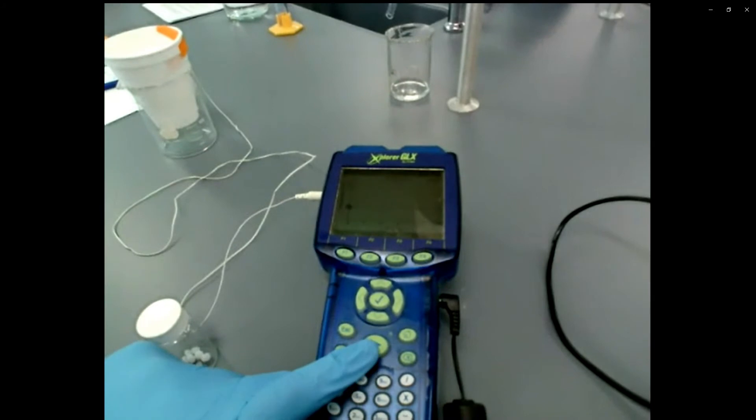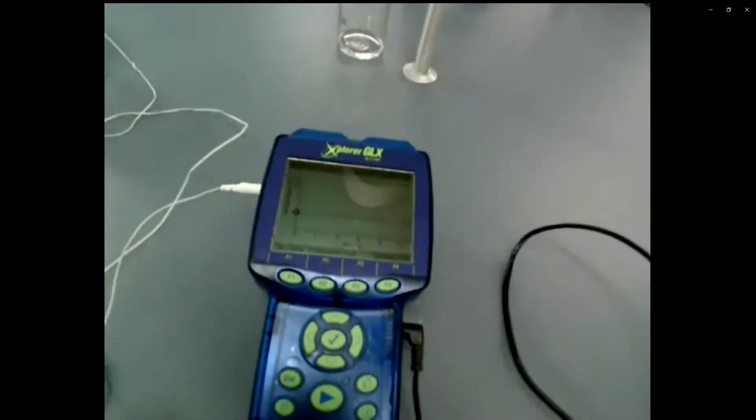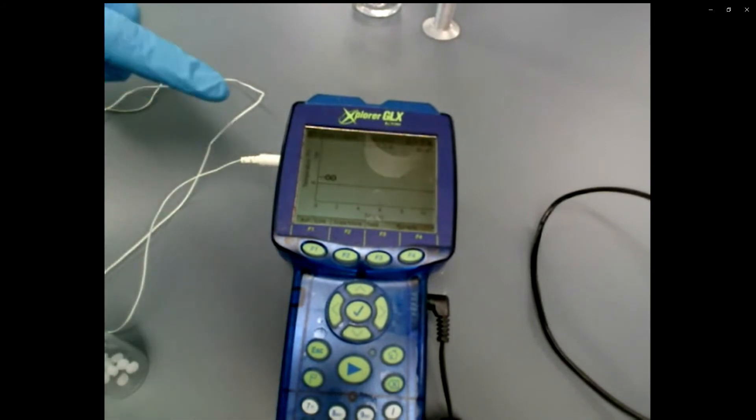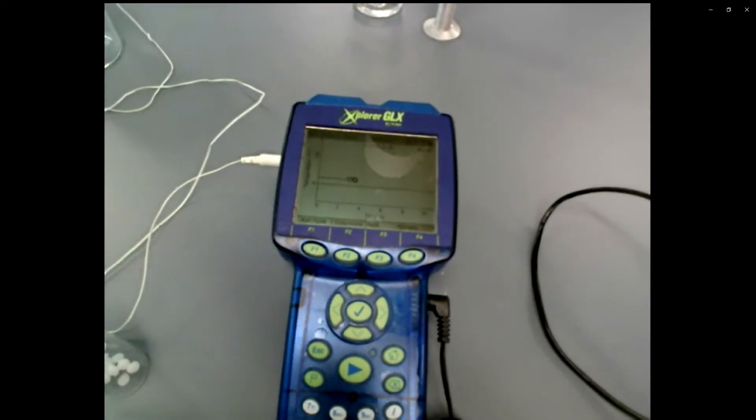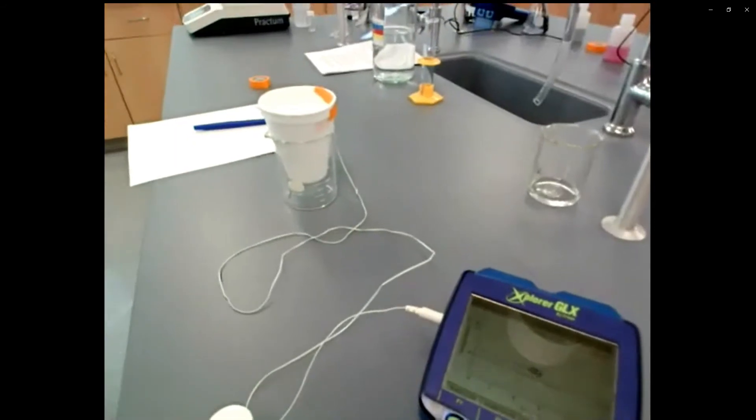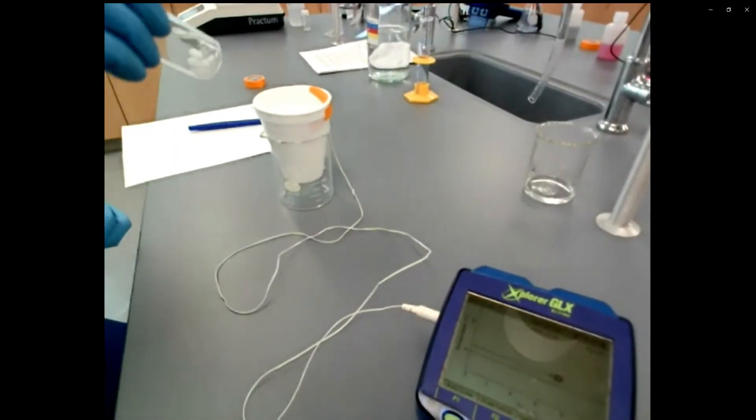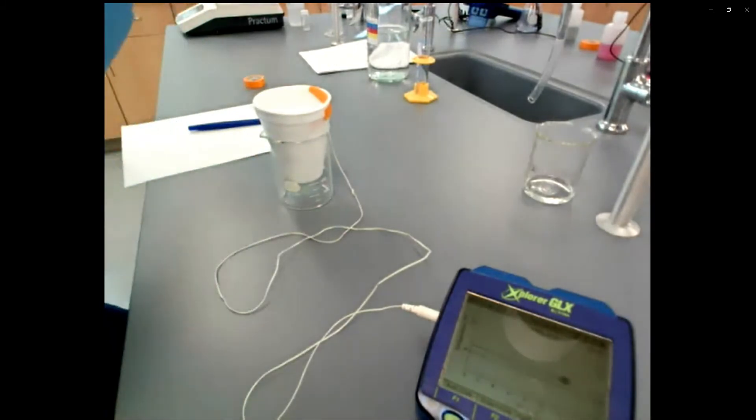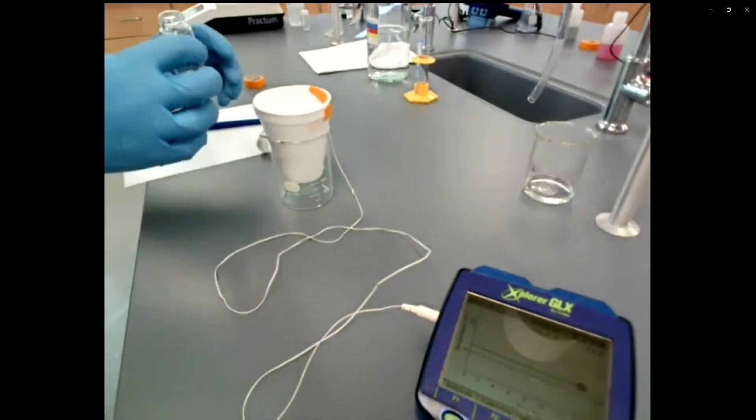So I'm going to push play. When I do that, you should see it start collecting a bunch of data points as the time goes, which it does. And this should be a flat line. The cup is at room temperature. Everything in the cups been sitting in this lab for a long time. It should just be a flat temperature of about 23 or so degrees Celsius.